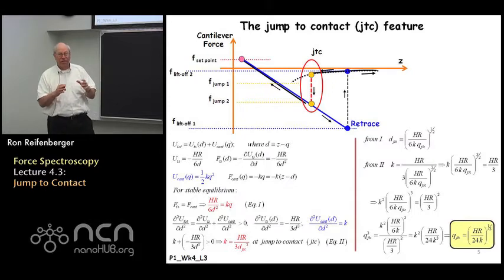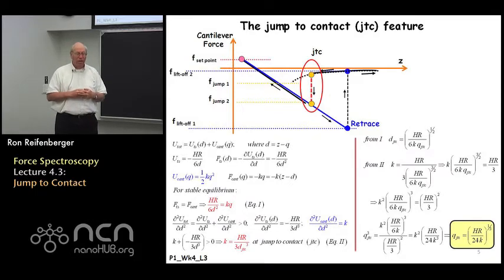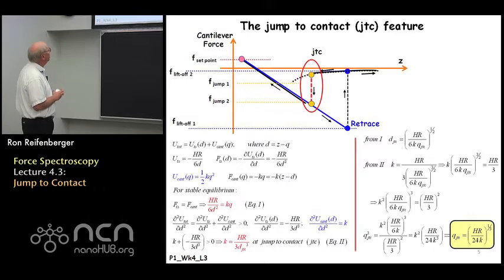Again, it's one of those slides that you're going to have to sit down and look at on your own. But basically what I've done here is I've got two equations. One equation, which I call equation 1, equates the force of the tip-substrate interaction to the force exerted by the cantilever when it bends through a deflection Q. So that's indicated by equation 1 on this slide.